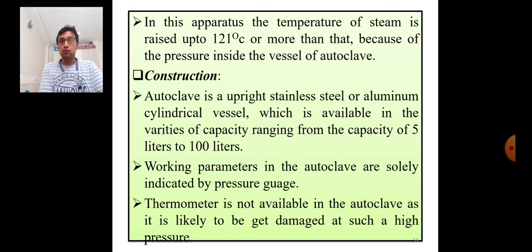So student, what I want to say, remember this particular point, that thermometer is not used in the autoclave because at such a high pressure of the autoclave, thermometer is likely to break. That's why we are not using the thermometer in an autoclave.